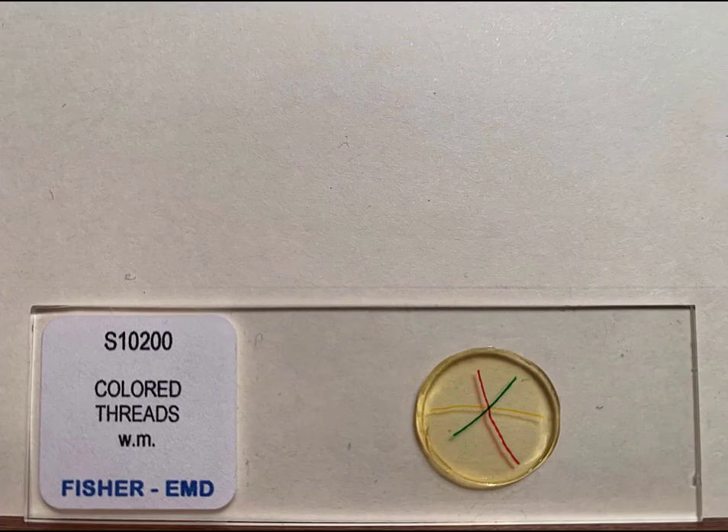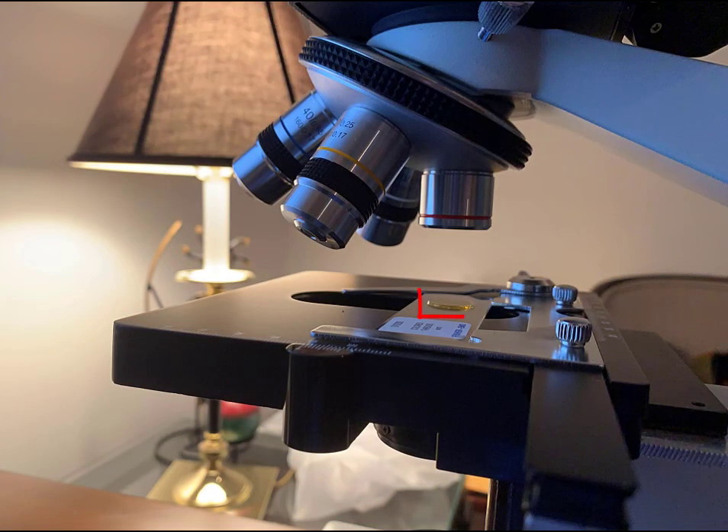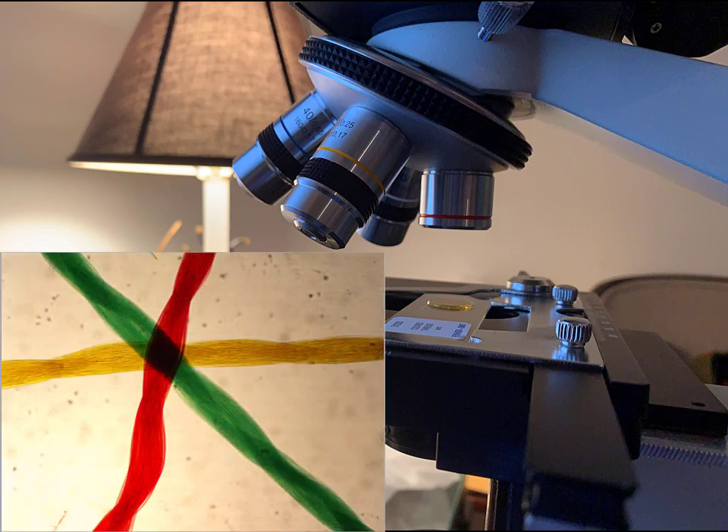A good way to investigate this in the lab is by using our colored thread slides. Here we have slides that have three threads laid over one another in such a way that we have three different layers, or three different planes of focus that we can play with. As always, we start by placing our subject under the scanning objective lens. You'll notice that while the slide may look small to our eyes, there really is quite a bit of depth on the slide when we consider it in terms of the scale of what the microscope sees. Under the scanning objective lens, the depth of field is actually fairly large and we can see all three threads fairly clearly.